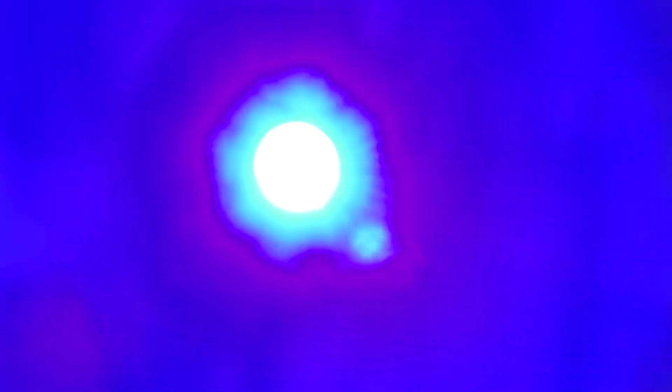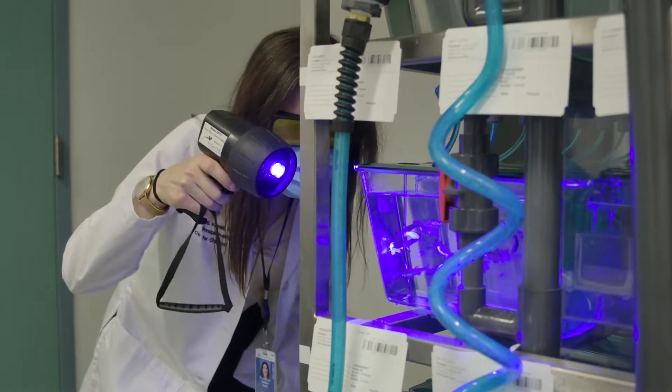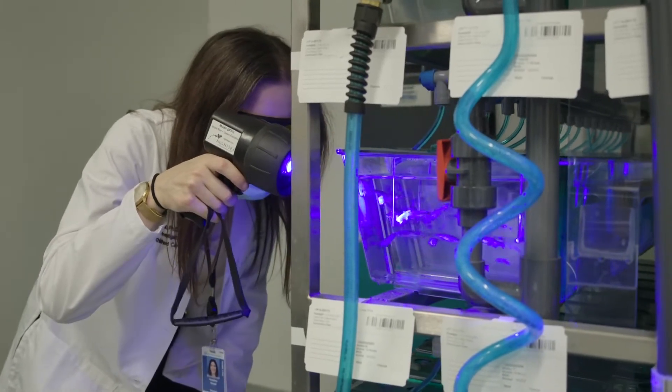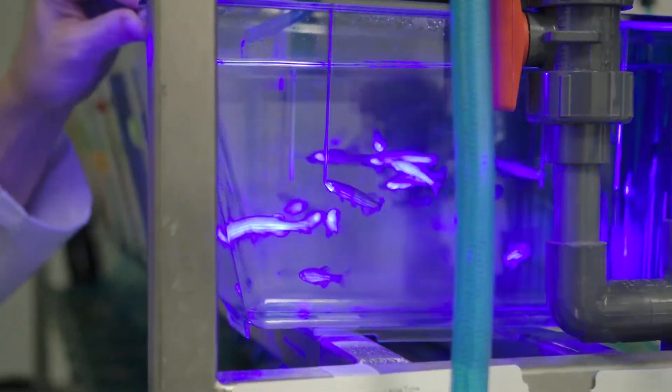We use the fluorescence, which is actually linked to the human cancer gene. So everywhere you see a bright green cell on the fish, or at least I can see it, that means that there's a cancer forming in the fish.